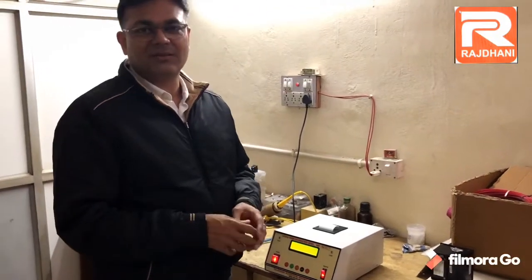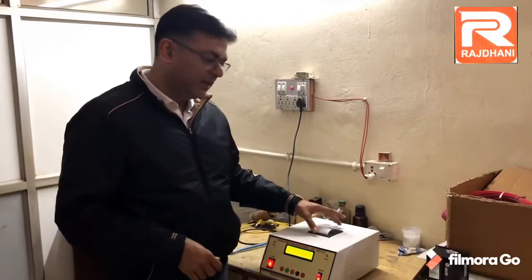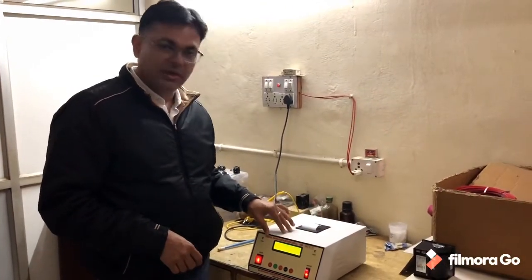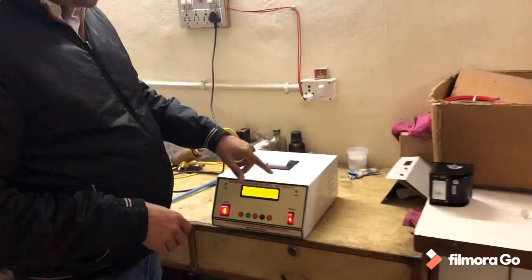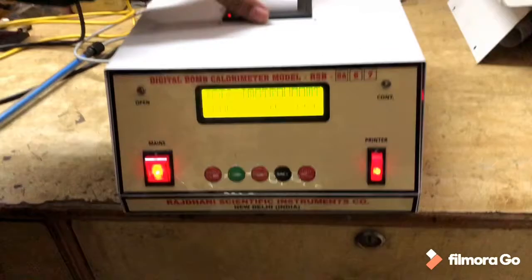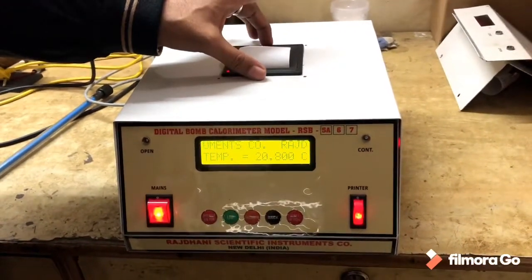Hello, I am Sudhir Jagit from Rajdhani Scientific Instruments Company. Today I am telling you how to replace the printer of a digital bomb calorimeter digital unit. This unit is the RSB5A67 unit. In this unit we have a printer installed, which is called an inbuilt panel thermal printer.